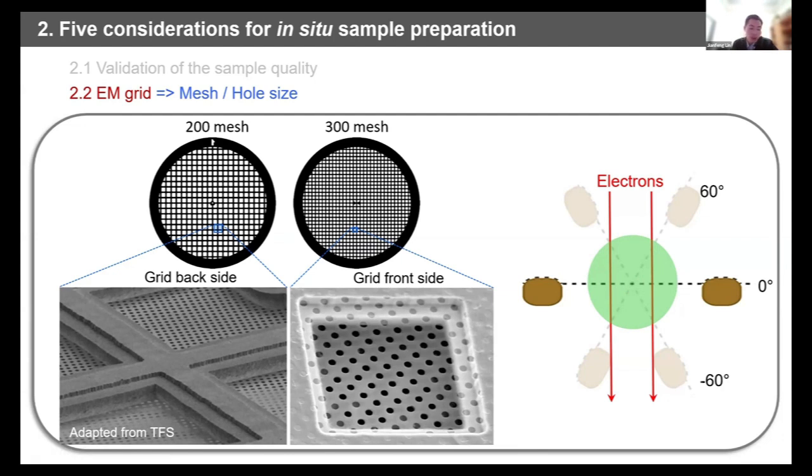So generally for cryo-ET studies, we also don't like to use larger squares, for example, a 100 mesh grid. For those grids the square is large, but it's really easy to break your squares. So 200 or 300 mesh is most commonly used for cryo-electron tomography. If you do single particle analysis using an in-situ sample, I think 300 mesh may still be a good choice.